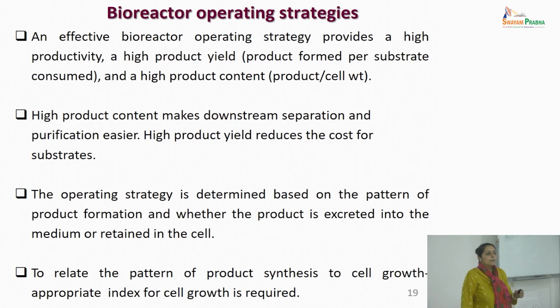But how do we measure the callus, because callus is being maintained on a solidified medium on plates? We measure the growth of the callus, which is your master or working cell bank, in terms of growth index. Growth index is a ratio of the change in the weight of the callus to the initial weight of the callus after a certain fixed time.